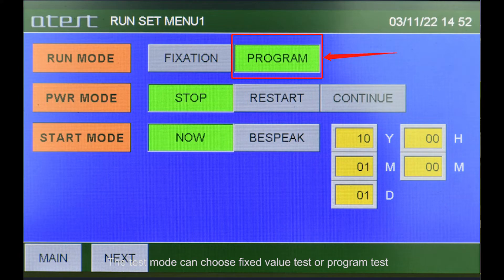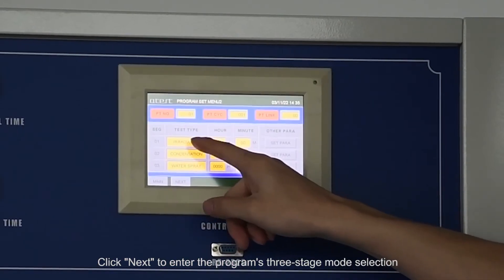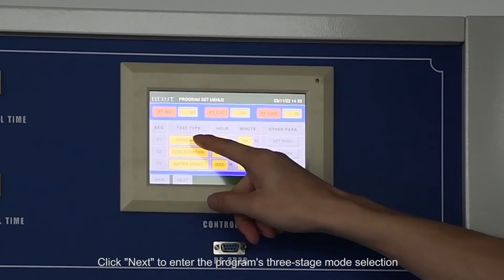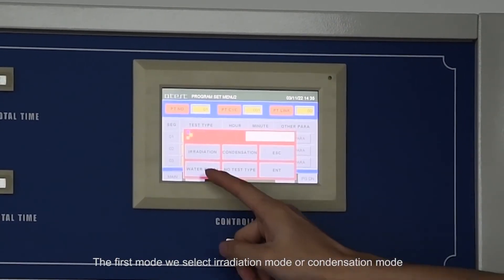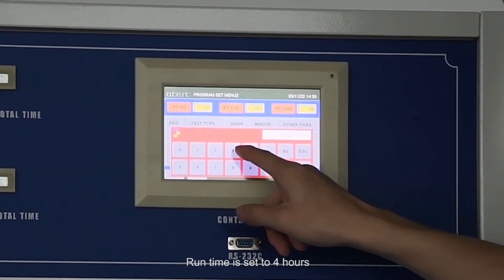After placing the sample, enter the control screen and select a test mode. The test mode can be either fixed value test or program test. Select program test and enter the program editing screen. The first field is the segment number of the program, the second is the number of cycles. Click next to enter the program's three-stage mode selection.